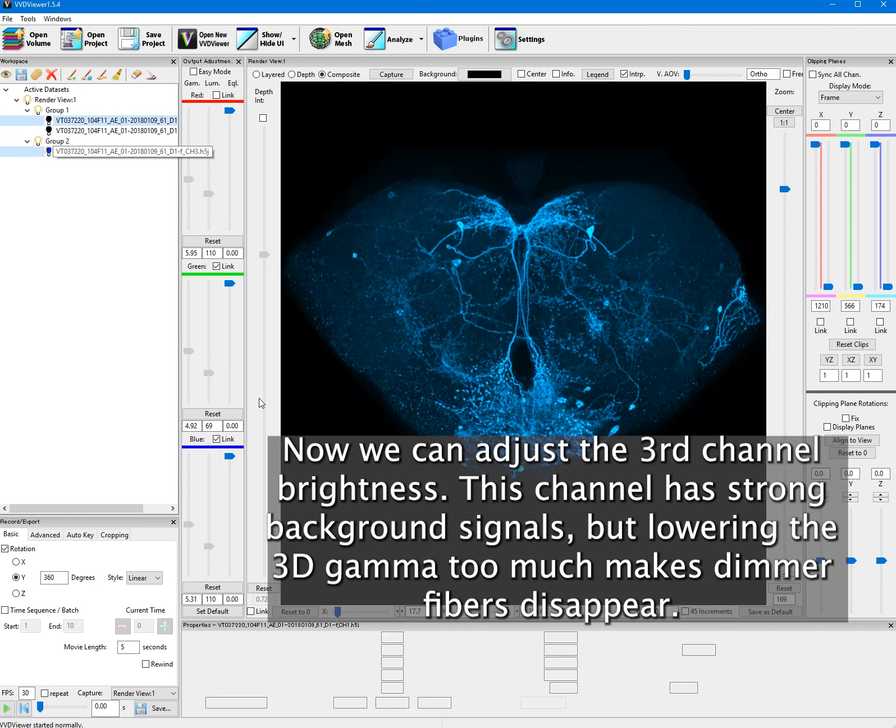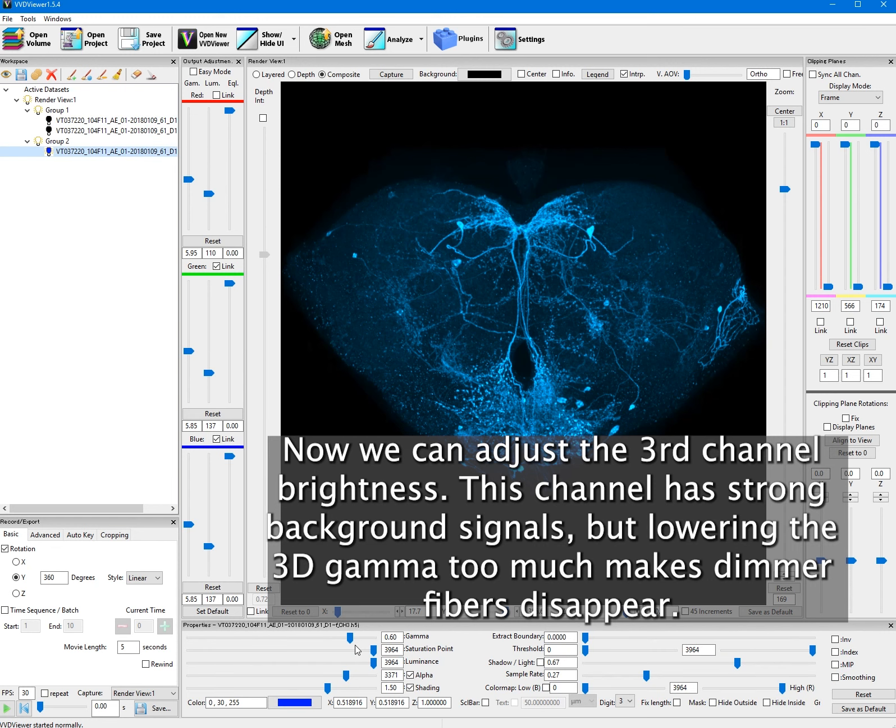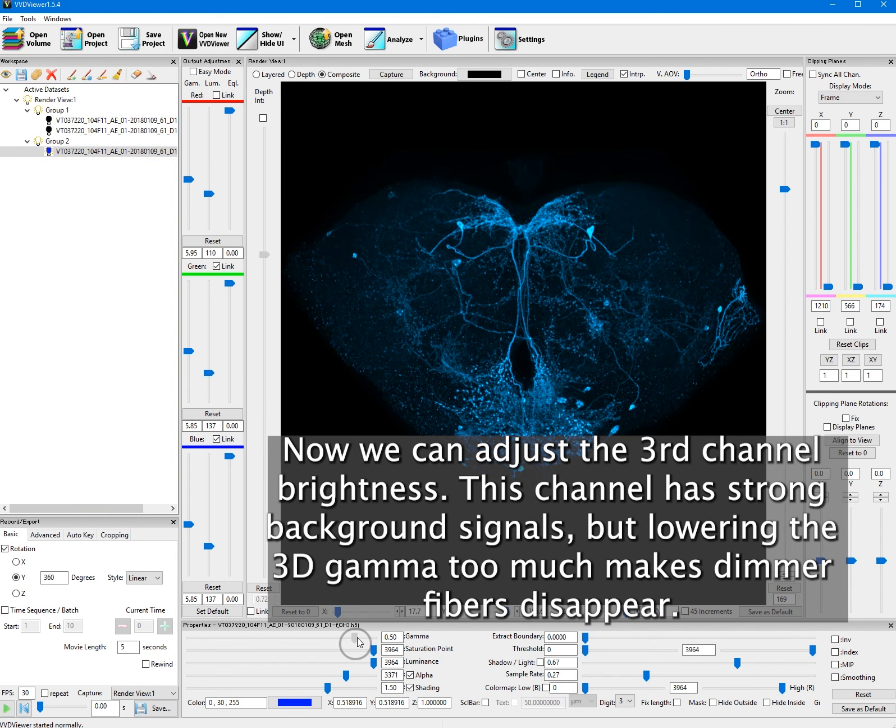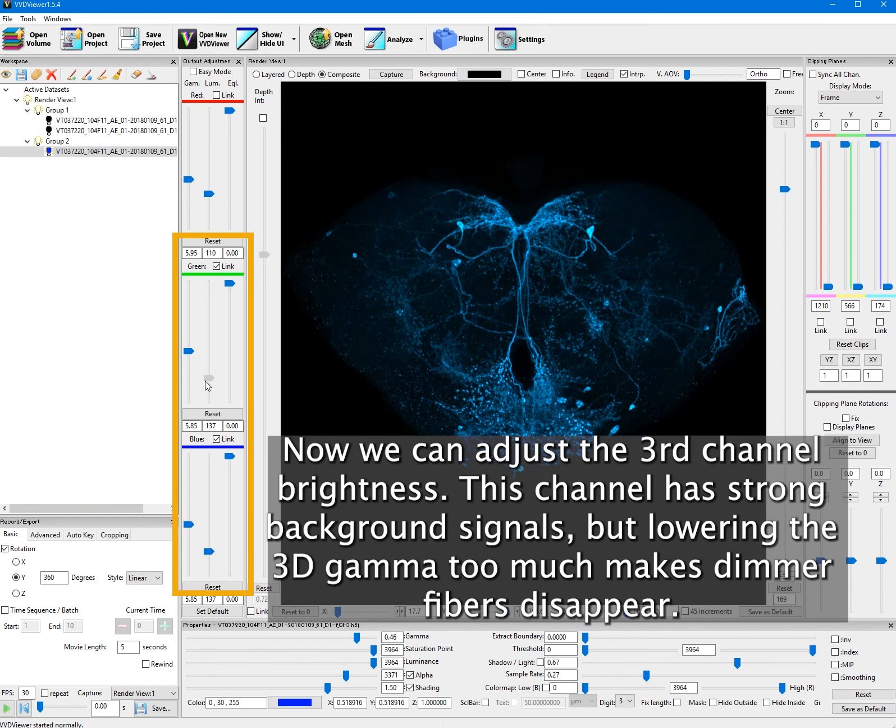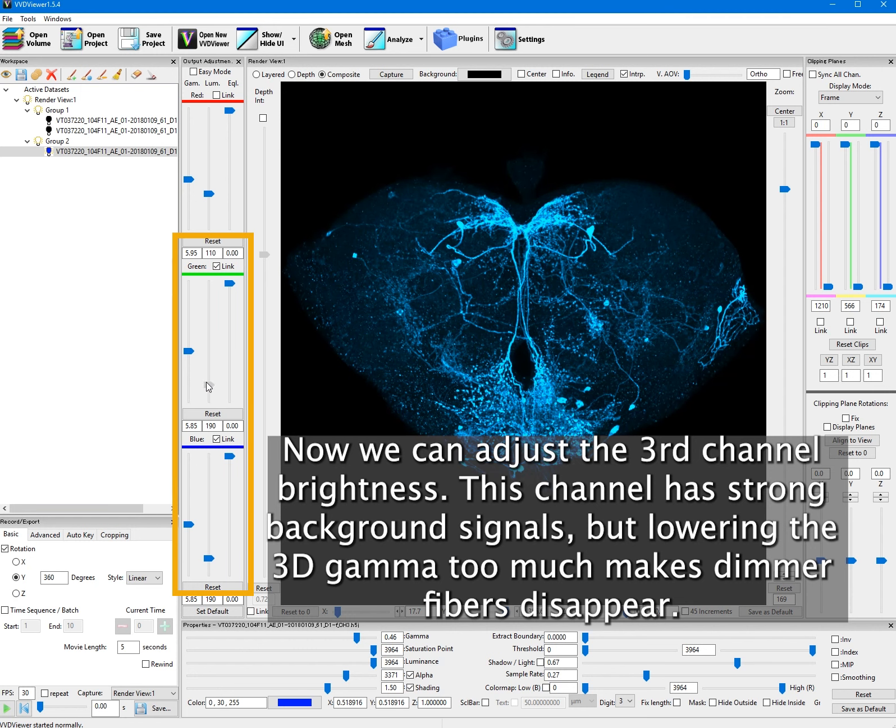Now we can adjust the third channel brightness. This channel has strong background signals, but lowering the 3D gamma too much makes dimmer fibers disappear.